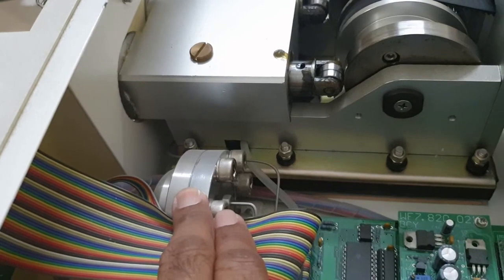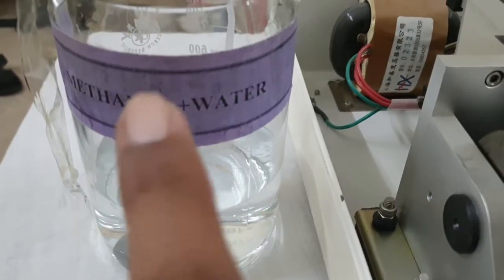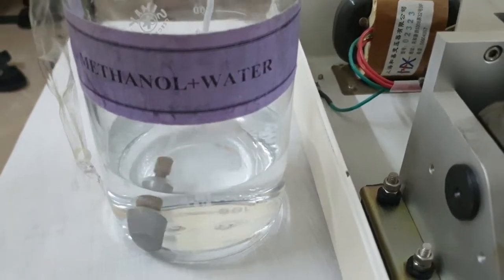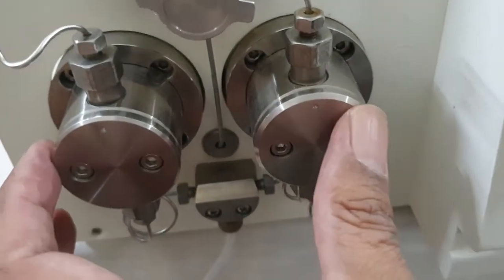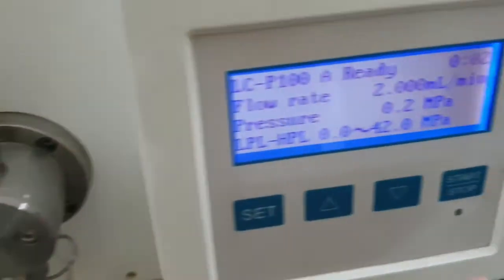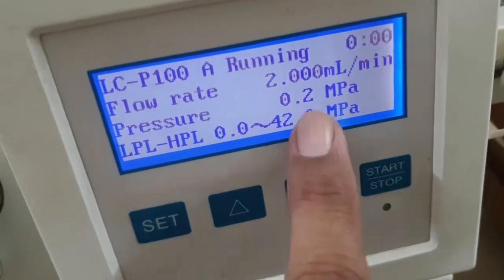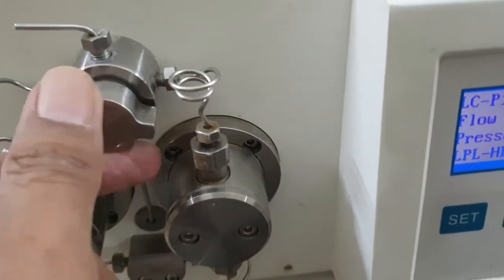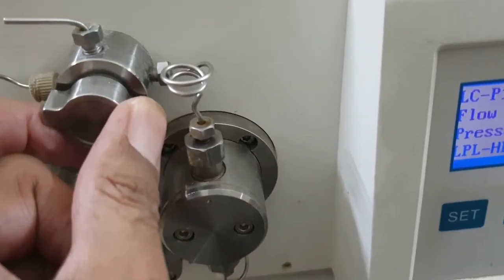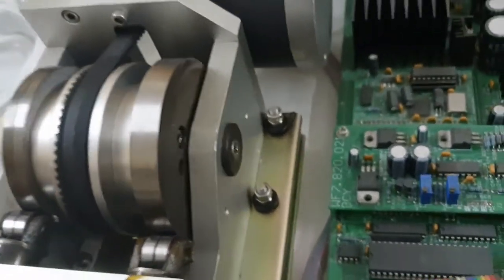This transducer is used to monitor the pressure built up in the lines. Now we attach the mobile phase through the tubing to the HPLC. The two heads of this pump are running. We will start the HPLC pump by pressing the start button — I have started it at a rate of 2 ml per minute. After priming, the HPLC is running and you can see the crankshaft running.